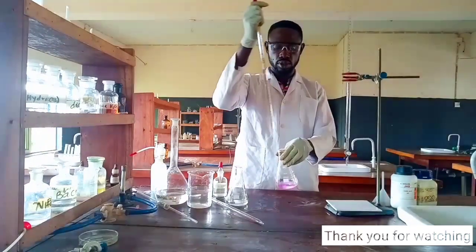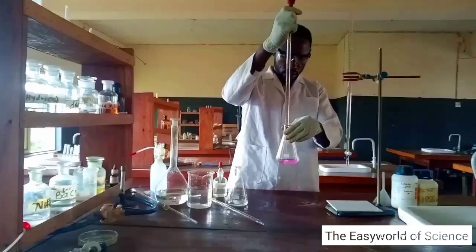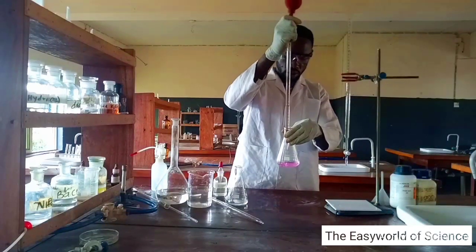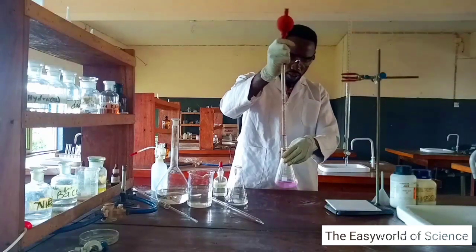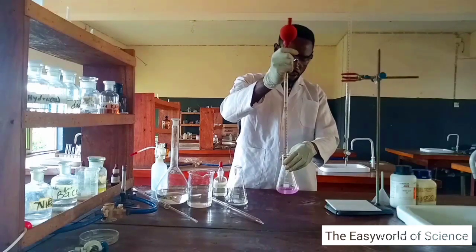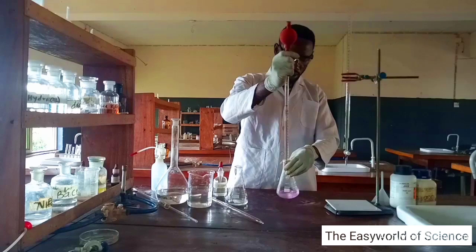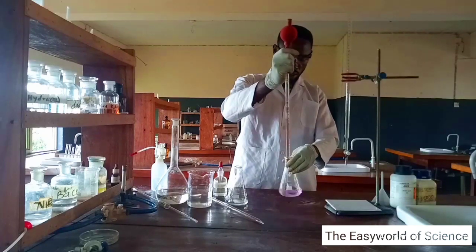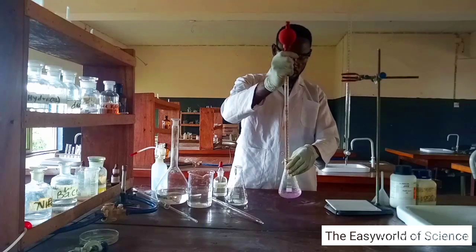My initial reading is 0.00. I start adding. It's obvious that it's going to consume more than 10 cm³.